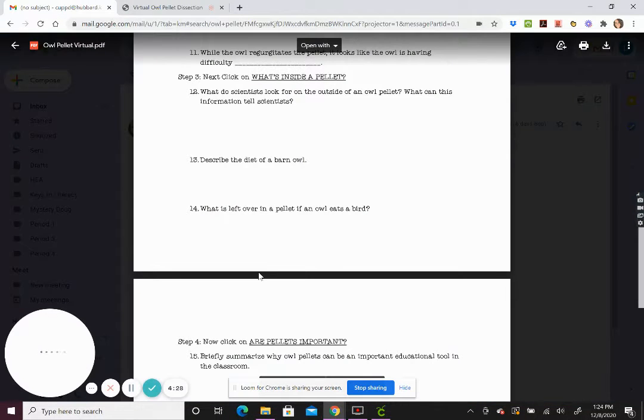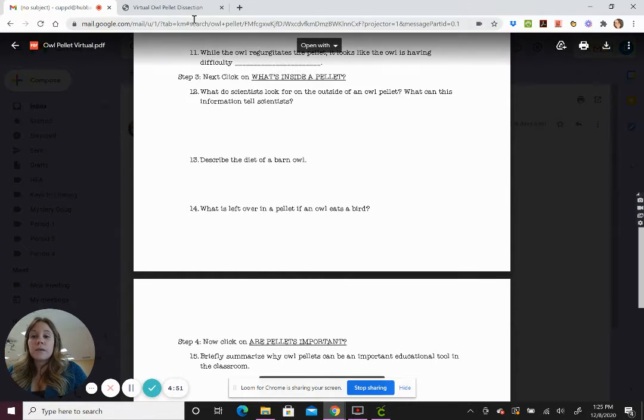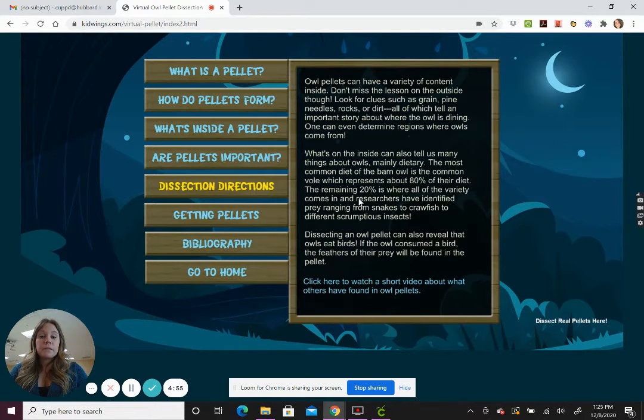So, you can answer the questions. What do scientists look for on the outside of an owl pellet? What can that information tell scientists? Describe the diet of a barn owl. And what is left over in a pellet if an owl eats a bird? You can answer those questions right now. Pause the video. I just read that to you, and I will even go back so you can pause it on this. You can reread that if you need to. Pause the video now, answer those questions.